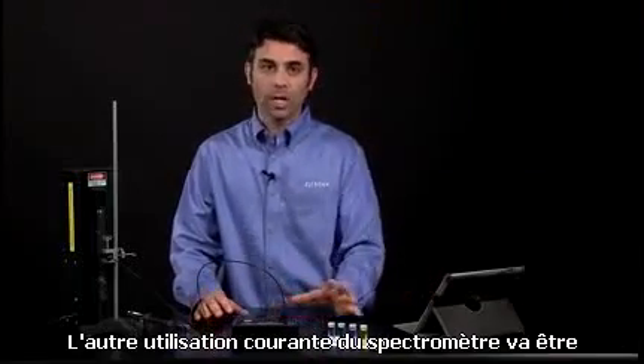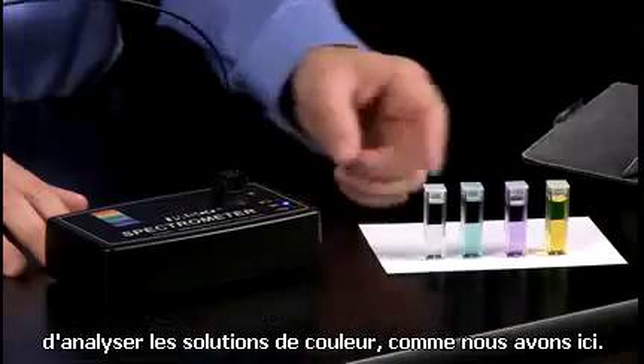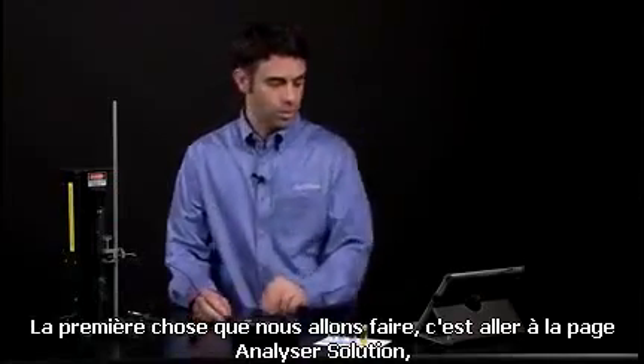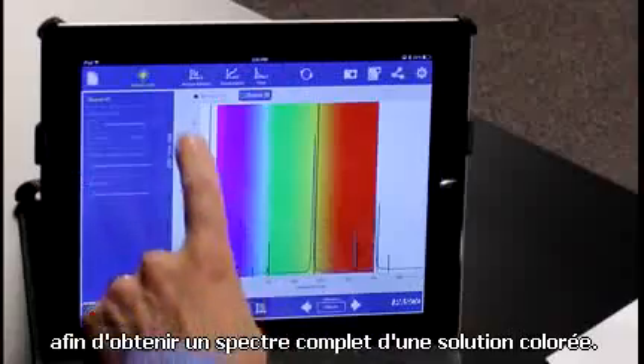That's analyzing light. The other common use for the spectrometer is to analyze solutions — colored solutions like we have here. The first thing we're going to do is go to the analyze solution page so we can get a full spectrum of a colored solution.